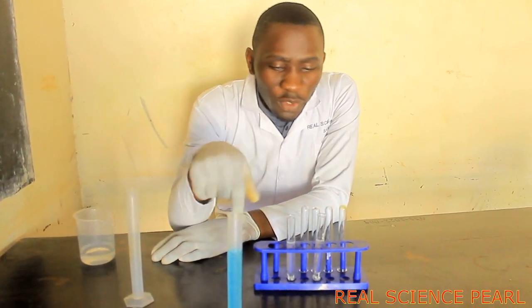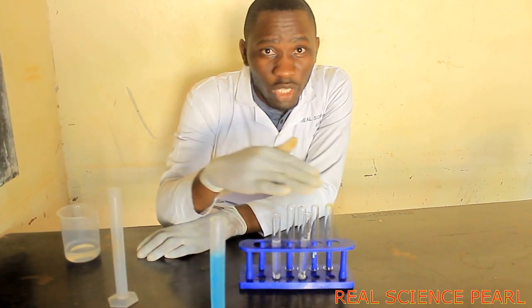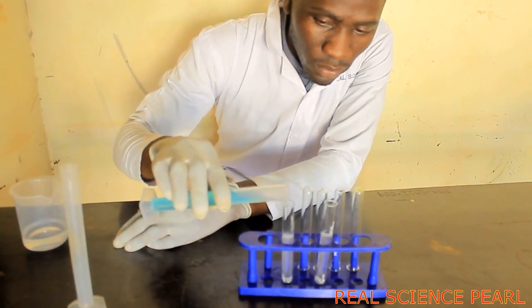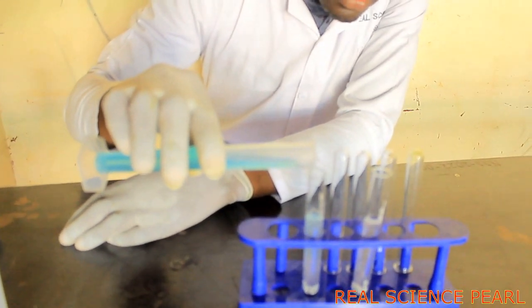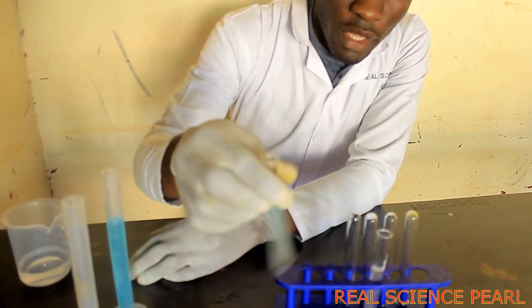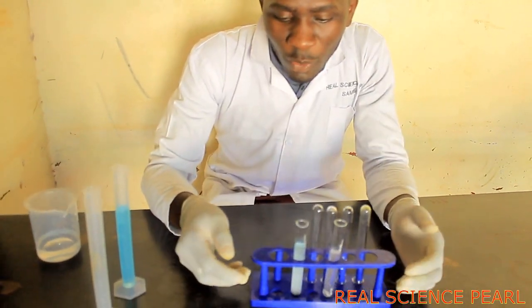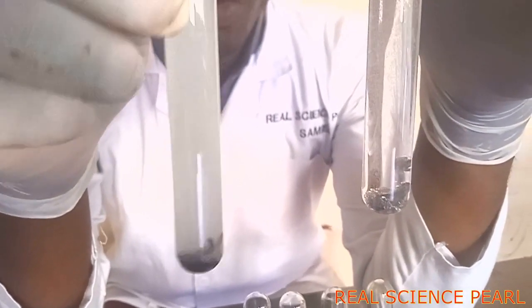Now let's see, if I choose randomly, because here I'm having the same quantity of zinc granules, same quantity of hydrochloric acid, now I'm going to choose one and add there a catalyst. So I can mix my catalyst very well, and we can compare what this copper sulfate solution has done to this reaction.